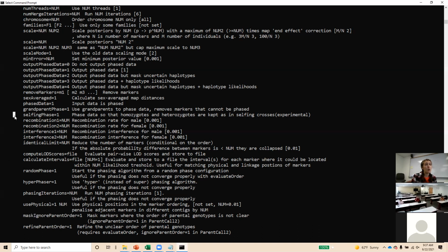No, I just open up the HapMap file and remove them. I actually have an R script that does it, but the easier way would be to open up the HapMap file and just delete those rows of markers that you don't want anymore. Then you can save that, reopen it in Tassel, and save it as a VCF file. So the output file from those you will load into Tassel, right? Yeah, I'll take my original HapMap file.